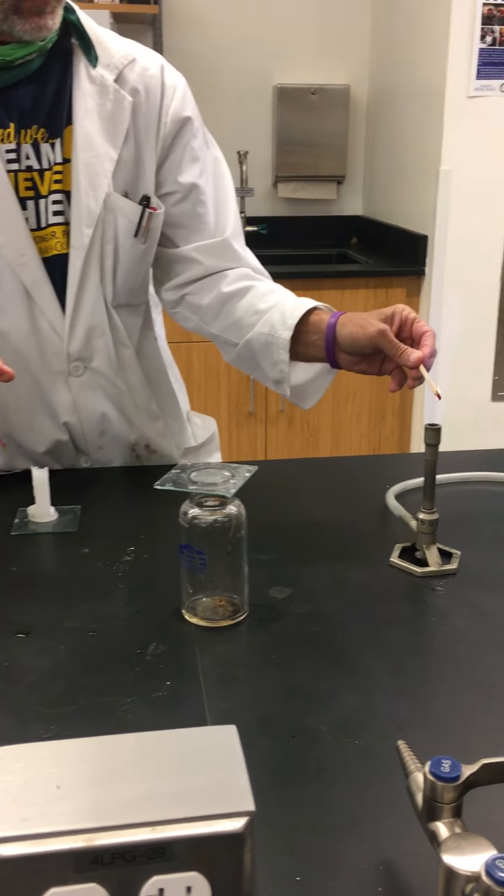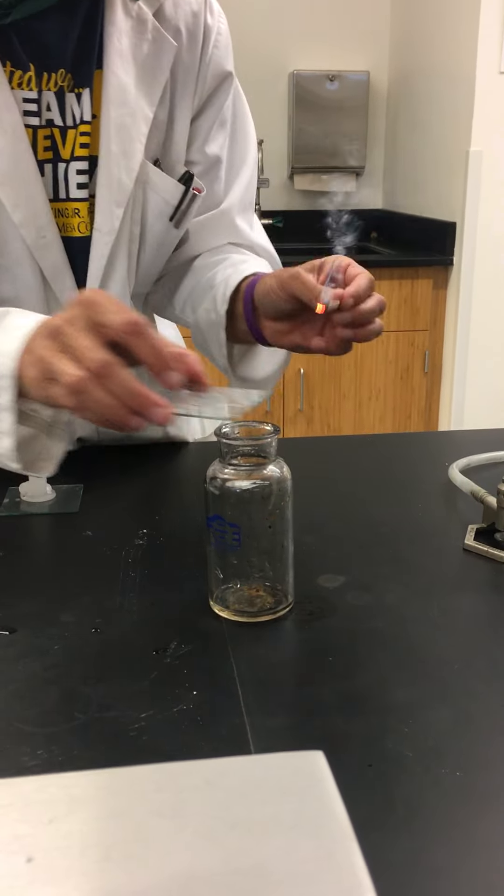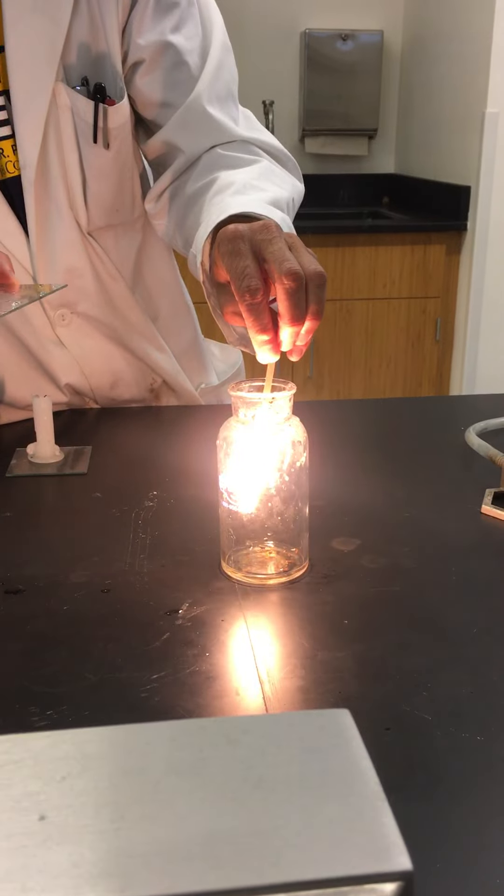Nothing happened. Let's try that one more time — did I grab the right bottle? Yes, I did. Glowing splint. There we go. It goes right back into flame.